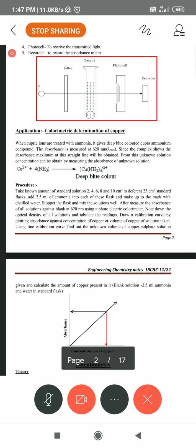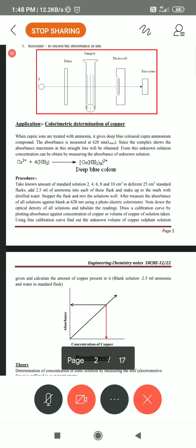How much of the radiation emitted rays are coming out? Based on that, it is showing its absorbance as 0.06. If you take 2 ml of the 8 gram dissolved copper sulfate solution, you observe the light is over, then the absorbance reading is 0.06. Afterwards you can throw it.